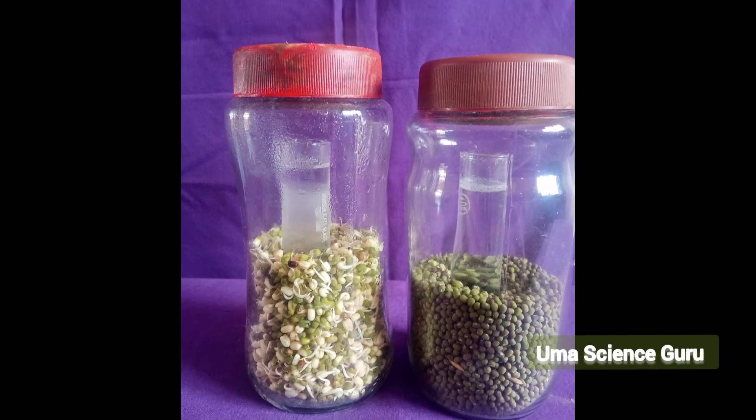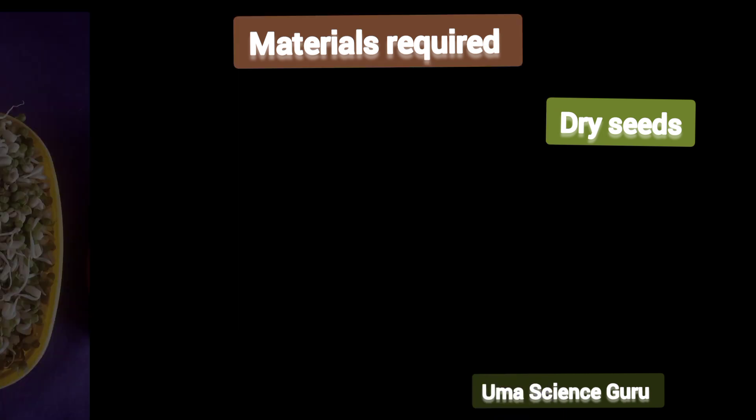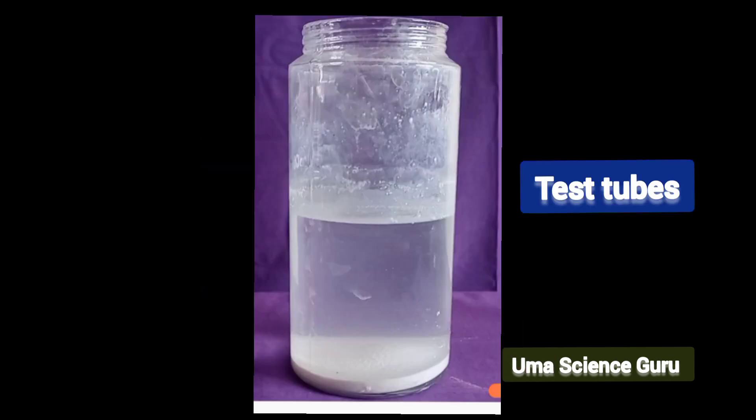We need some materials to do this experiment, such as dry seeds, germinated seeds. Take two plastic or glass bottles and two test tubes, and lime water.